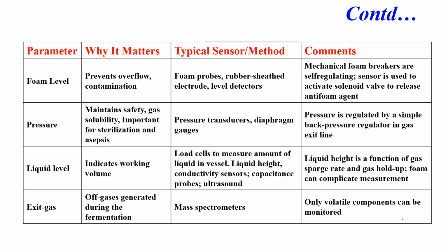Magnetic inductive meters are good for viscous fluid or fluid with a high level of viscosity. Other physical parameters are the foam level, pressure, liquid level, and let us say off gas.